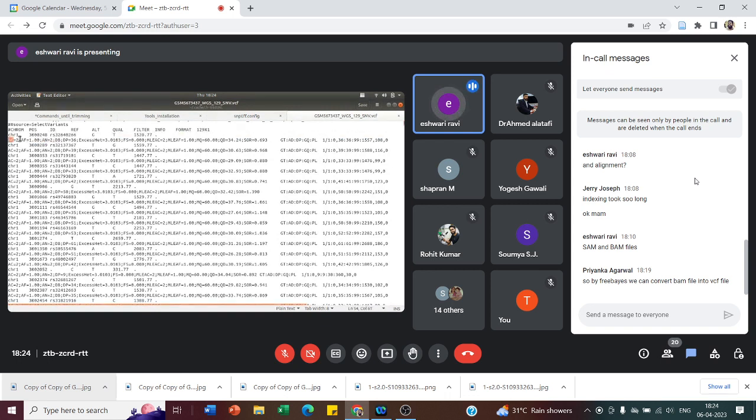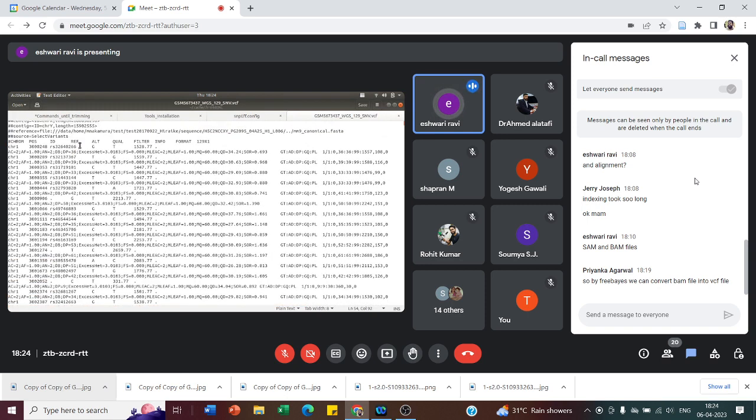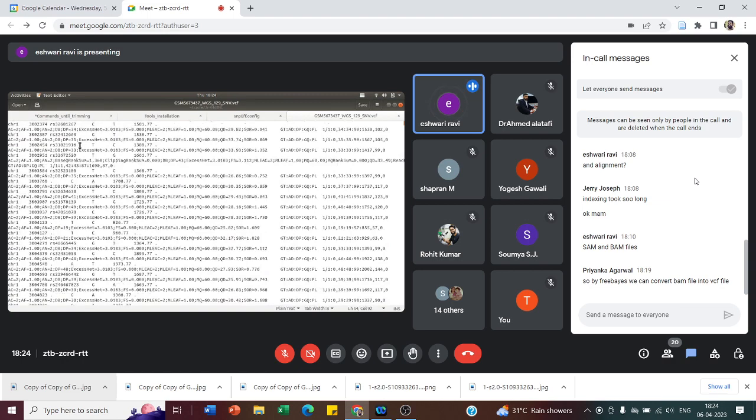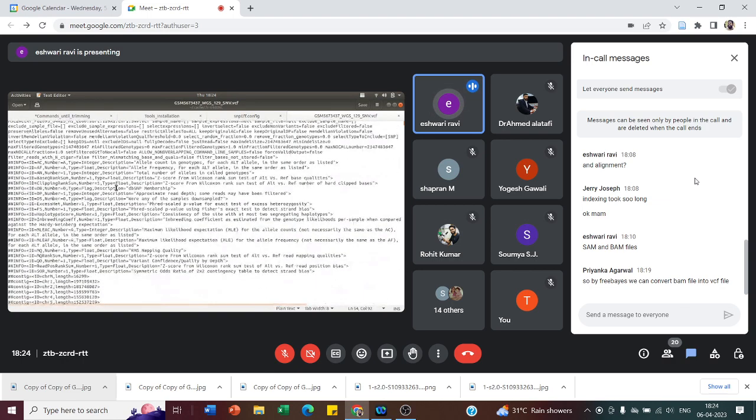Then it has given us information about the allelic frequencies, nucleotide, and depth of the allele, etc. So this is the minimum quality score and everything. Some people take into consideration the allelic frequency, allelic depth, etc. Some just give their default values and proceed with variant calling. Does anyone have any doubt in this format, or in what I was explaining now?